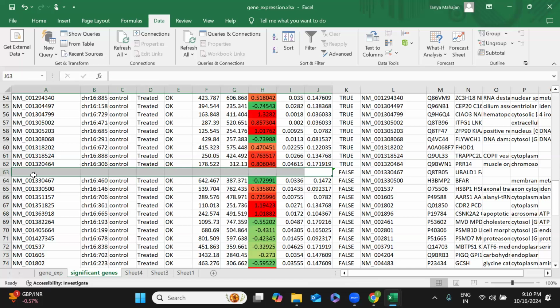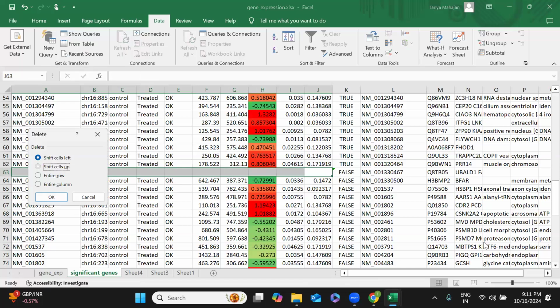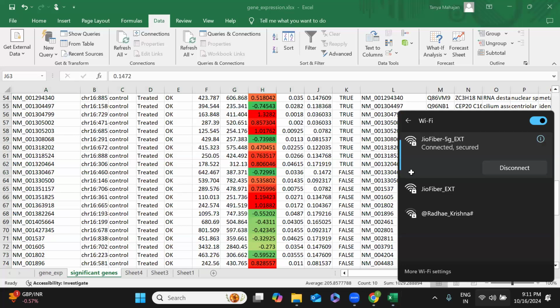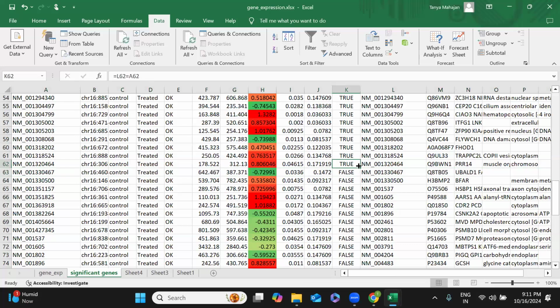Yes, ma'am, I have done. Now, can you see like in the 63, it is matching 467, right? Yes, ma'am. Now just select the true entries and autofill it again. Okay. Done?